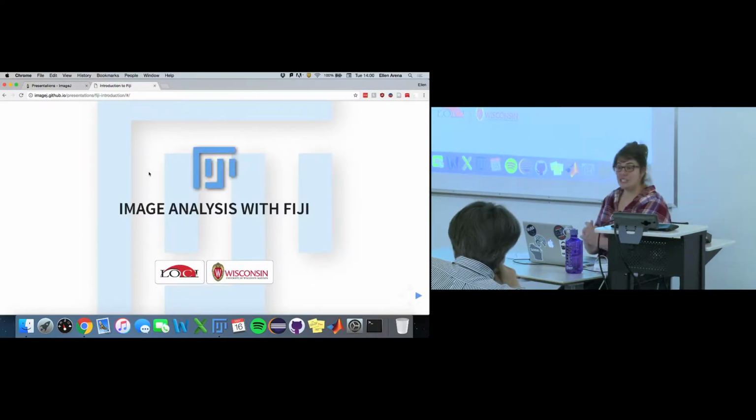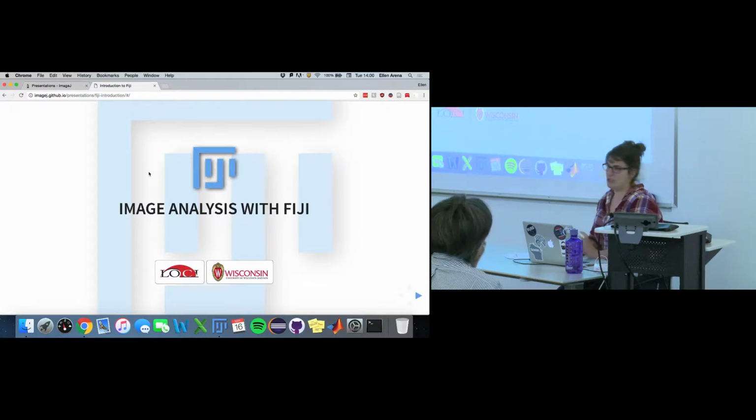Okay, let's get started. So what is ImageJ? ImageJ is an open source software package that's specifically built for scientific image analysis. This is not Photoshop. This is a tool for doing science, which is why presumably you're all here. It's been designed to be aggressively transparent, as this leads to open science, not to mention the fact that our work in building this system is federally funded by taxpayers.